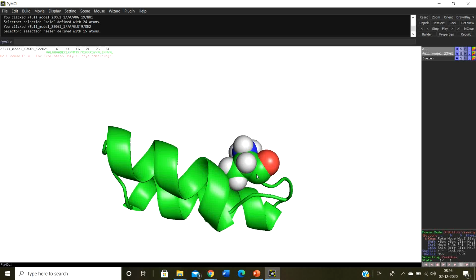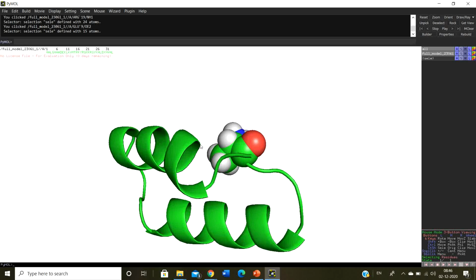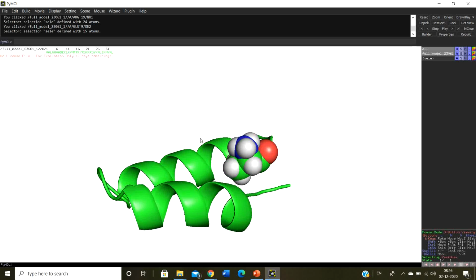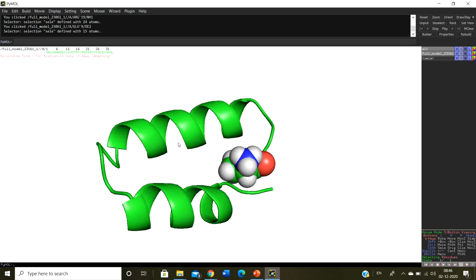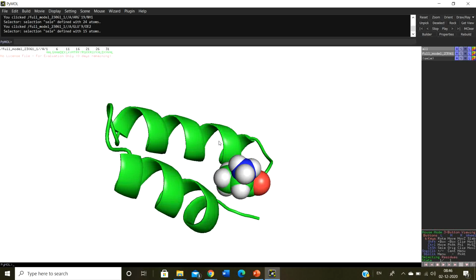Now see, it is going to mark the particular residue as sphere. Right? So only these particular residues are important. This is really important, because sometimes, as you know, in protein structures, you're going to find some unique residue that is responsible either for the agglutinations or the aggregations, or to make a very important connection, or to mark the exact active site.